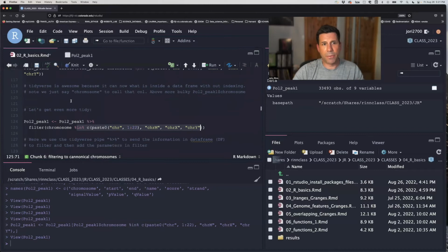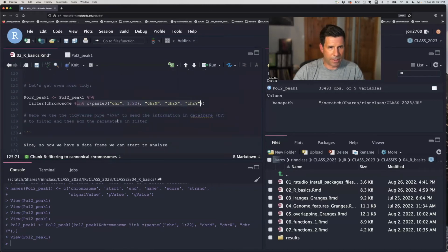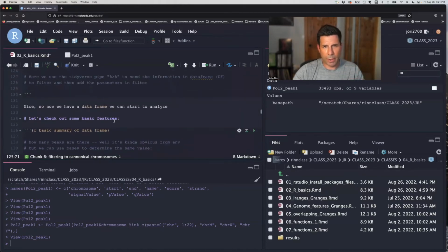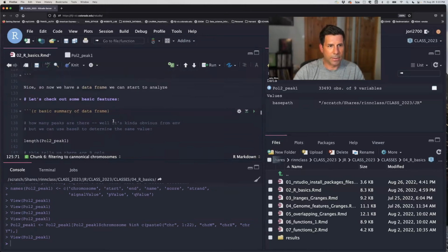Okay, that's 3 different ways to do the same thing. This is often the case, and you can read more about the differences in these operators here. Just kind of going through it, pointing out the concepts, but all of it's written down so you can go back if we're going a little fast.